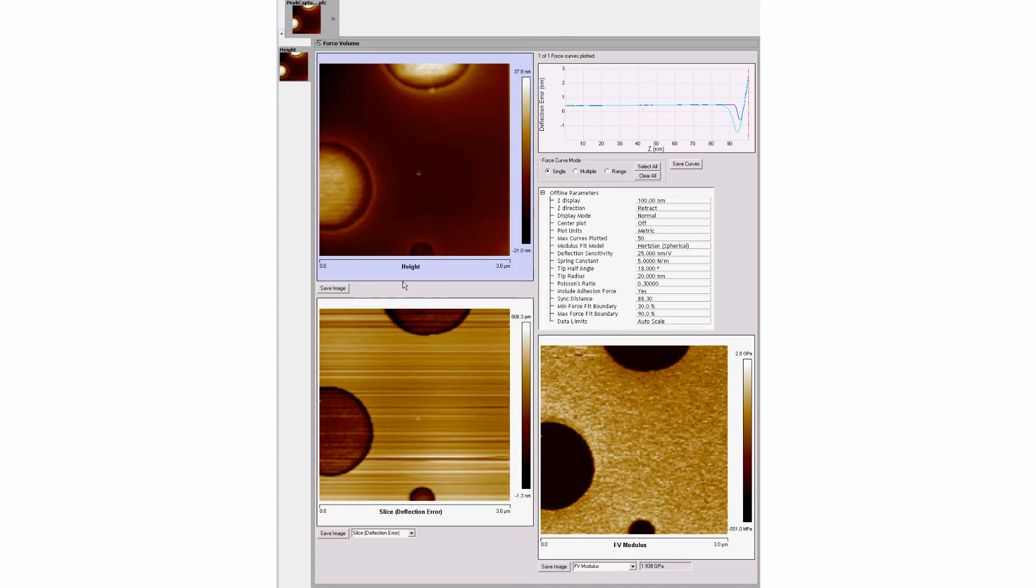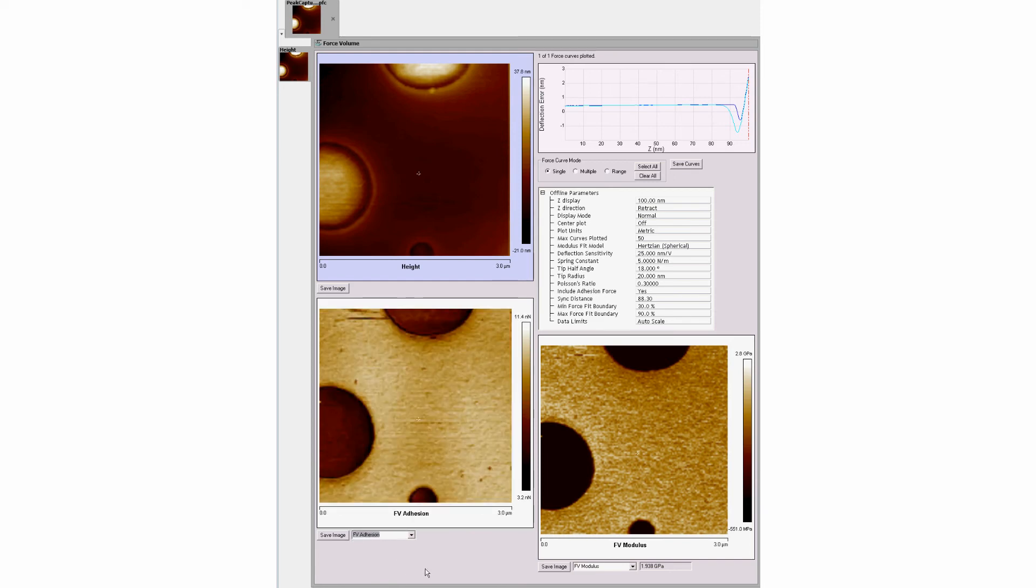Force volume image files can be opened in Nanoscope analysis to display deflection or adhesion data according to the user's requirements. Use the cursor to select various locations in the image to display measurement data from that point.